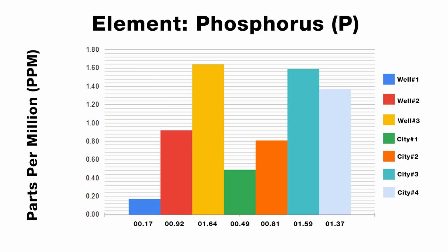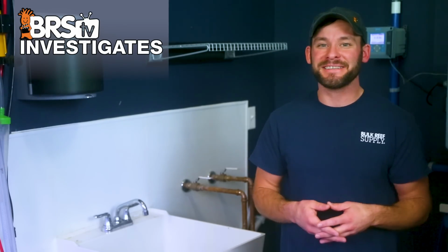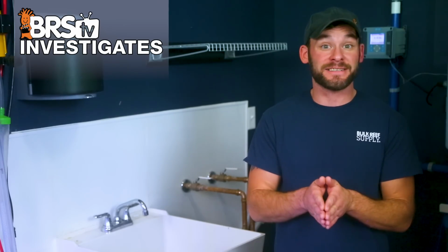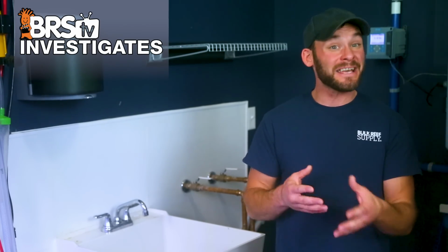Phosphorus was also detected in each water sample, where half tested around 1 part per million or more, some over 1.5, and way higher than what we'd like. But at the same time, there was 1 sample at 0.17 parts per million, which may not be a huge concern. Phosphorus is another one of those elements that perks our reefing hobbyist ears as being something we want to avoid from purposely adding to our tanks, and another big part of why reefers choose RO filtration to begin with.